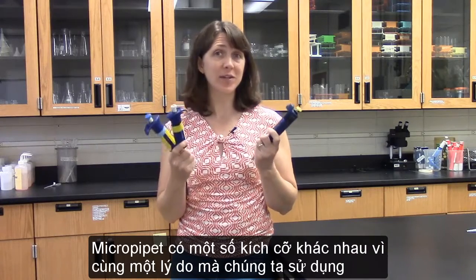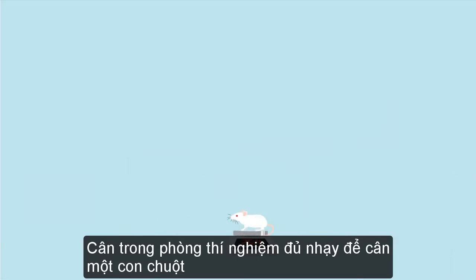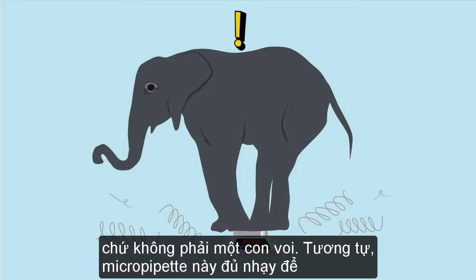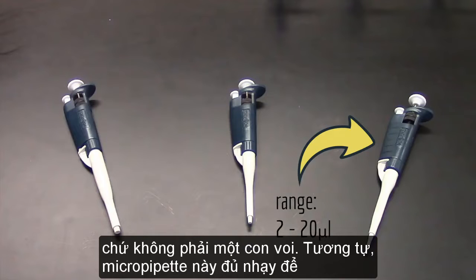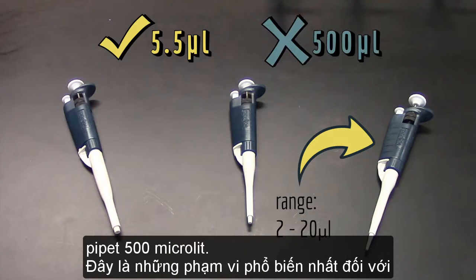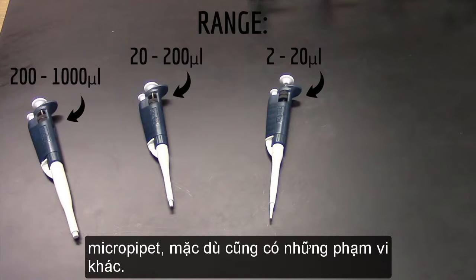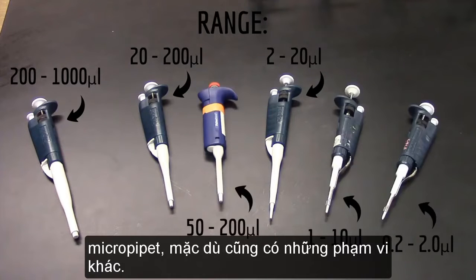Micropipettes come in a few different sizes for the same reason we use different scales to weigh different types of animals. A laboratory scale is sensitive enough to weigh a mouse, but not an elephant. Similarly, this micropipette is sensitive enough to pipette 5.5 microliters, but it doesn't have the capacity to pipette 500 microliters. These are the most common ranges for micropipettes, though there are other ones as well.